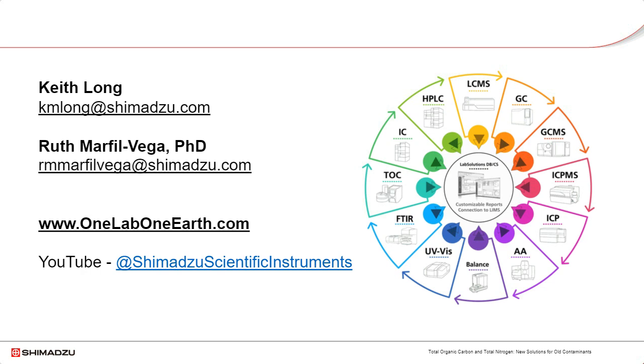Perfect, and that relates to another question in the chat, asking if volatile organic matter can be analyzed with the TOC-L. As you were mentioning, there is the non-purgeable and purgeable. Correct, it can be analyzed. It's not a very common application to measure purgeable organic carbon.